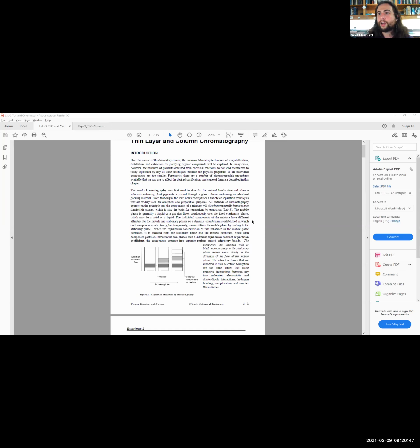Very simple example, water versus oil, right? So oil, hydrocarbon chains, we can think of that as our non-polar situation. However, water, hydrogen bonding, extremely polar. And then we have a myriad of solvents that have different polarities. You can even look at ethanol as a primary example, and that is mostly polar. However, it does have 2 carbon chains on it, making it slightly non-polar. So that is why we use different solvents in the lab, different mixtures.